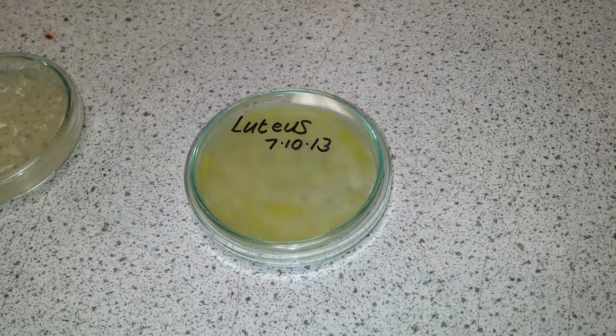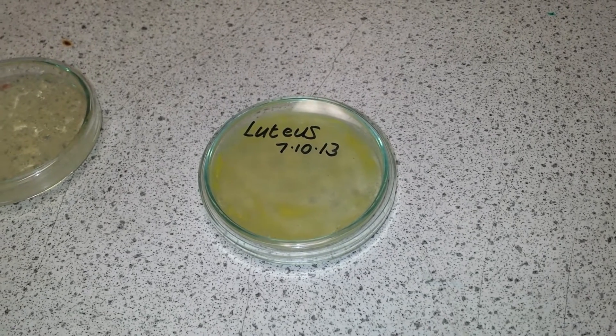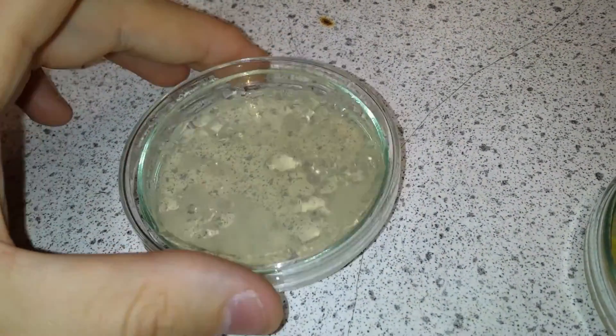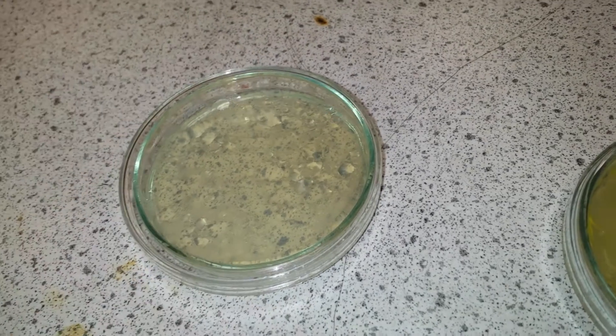We can investigate the growth of bacteria in the laboratory using agar jelly dishes. The first step is very simple — we prepare a dish with some agar jelly in the bottom and keep it nice and sterile with the lid on.